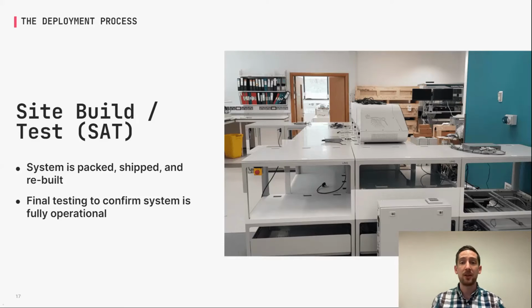And it's just kind of a final sign-off for everybody to say, this looks good, this is the project that we had envisioned, this is what we want to move forward with. Once we're fully operational, it's then time for the best part of automation, to get to use it, to get samples on there, and really start getting that clean data and that scalability that you're looking for.